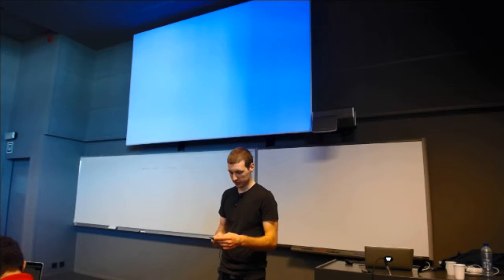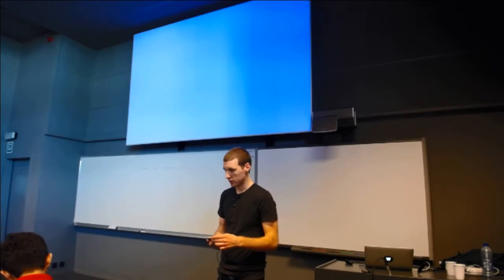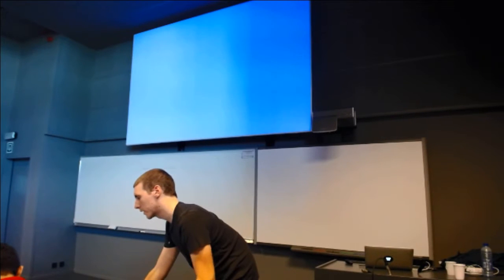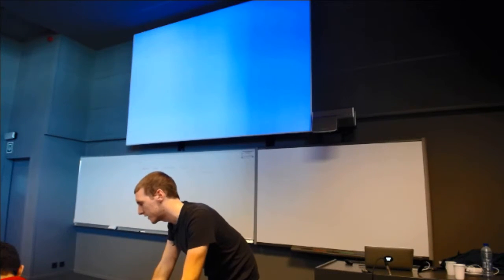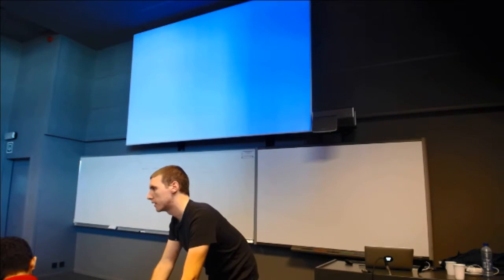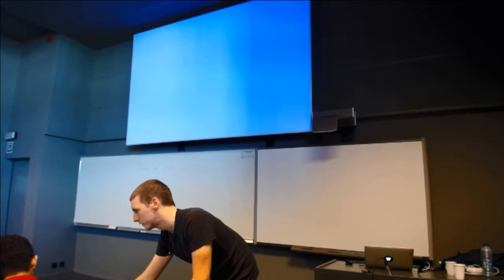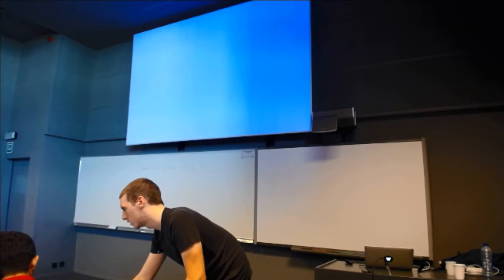I can't edit the assay. No, it shouldn't be a browser problem. So the question is, I cannot edit the assay. I'm guessing they are in the assay detail view. I just have to go there.